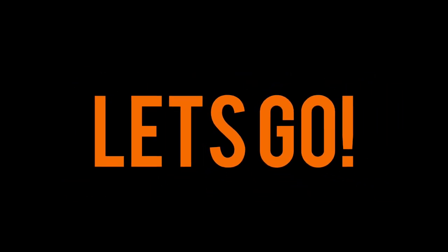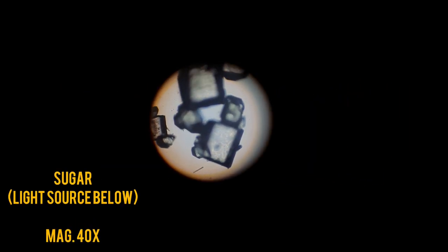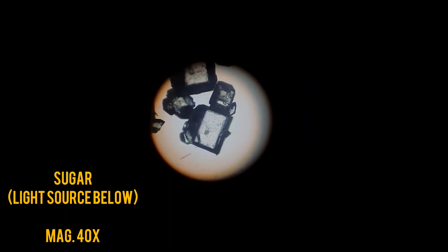Enough chitchat, let's check out some objects under a microscope, shall we? This one is for all of you who have a sweet tooth out there. That's right, these are brown sugar grains.